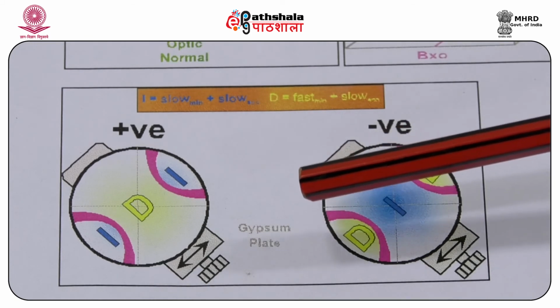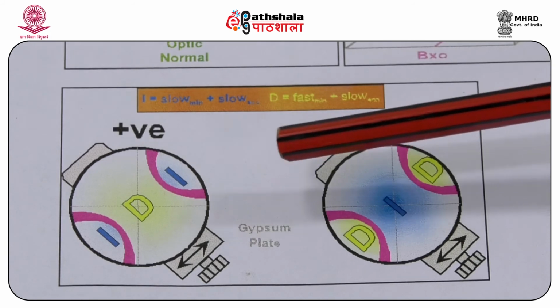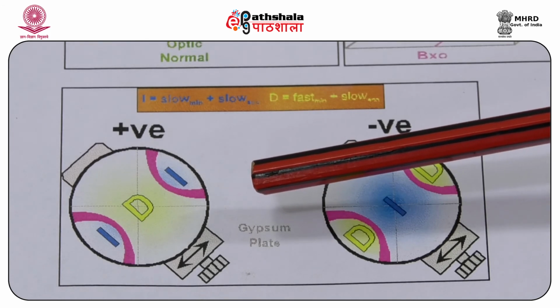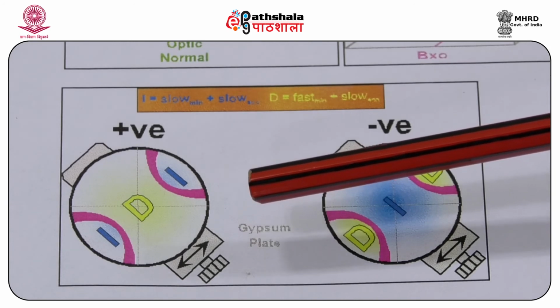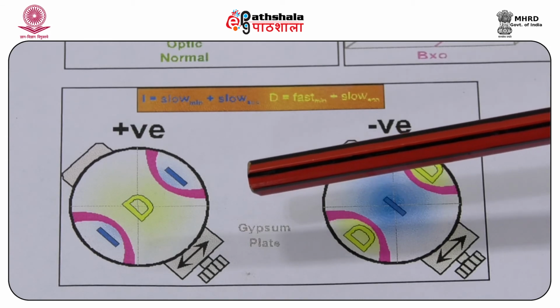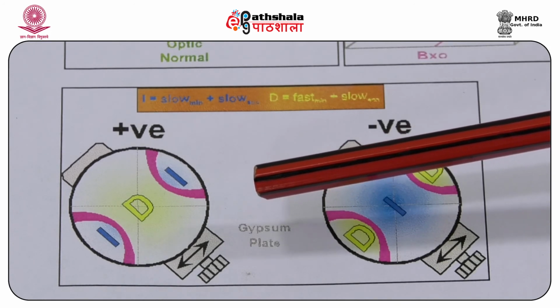This color change tells us that the ray vibrating parallel to the optic plane has a low index of refraction and must correspond to the n alpha, that is the retardation of the alpha ray as measured along the x indicatrix axis. Therefore, the z indicatrix axis must be the acute bisectrix.